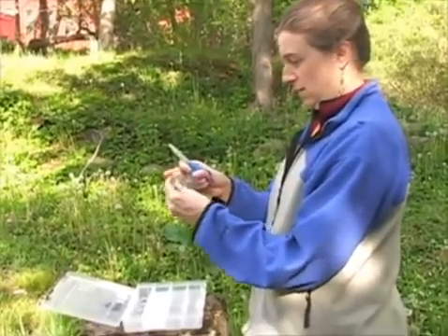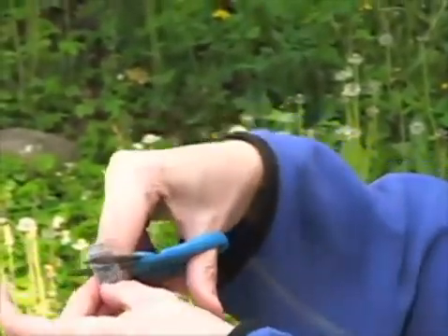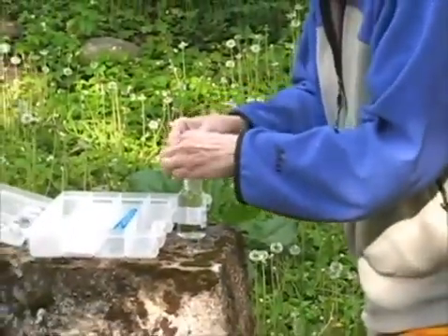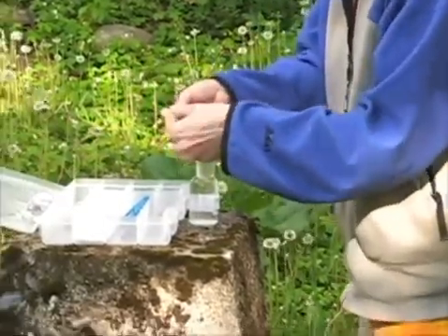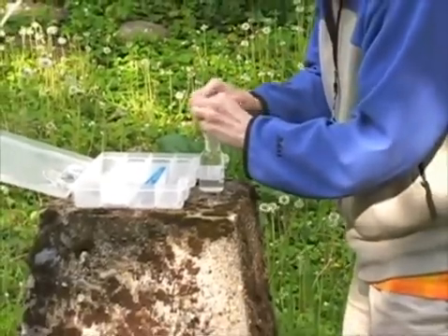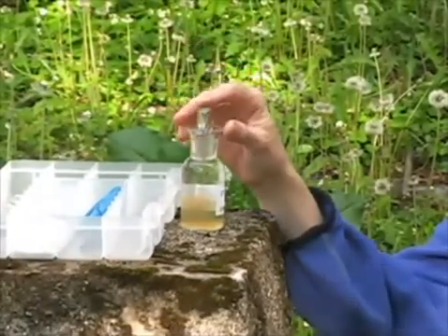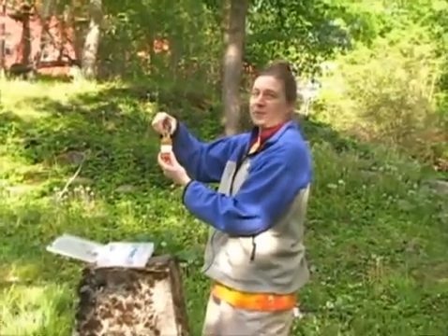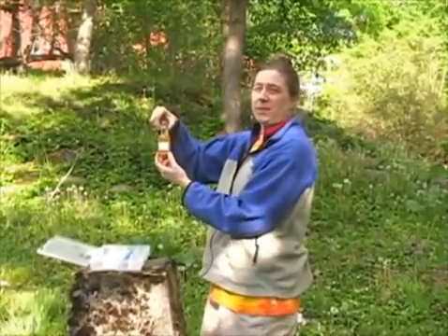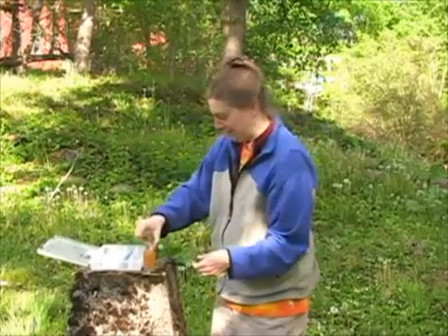All right, let me zoom in a little. Okay, go ahead. Bubbles, which is a no-no. No air bubbles. If you get air bubbles in the bottle, you have to dump the sample and take it again. And I've got air bubbles. Okay. Sorry. Let's try the second one.